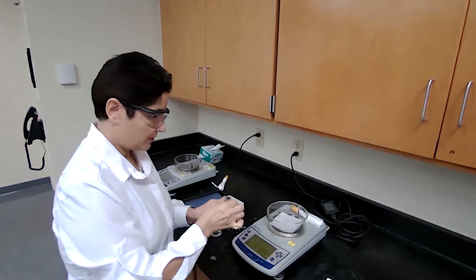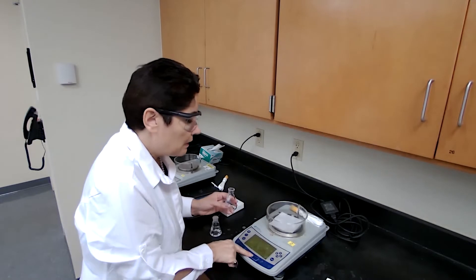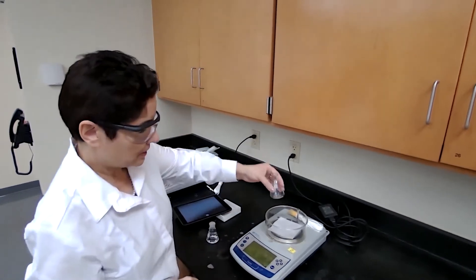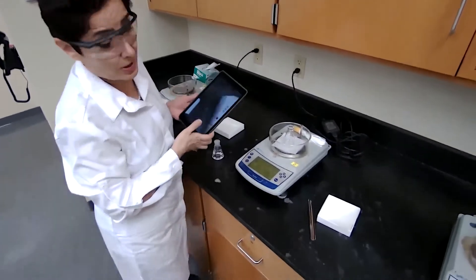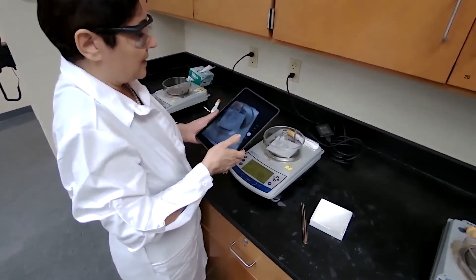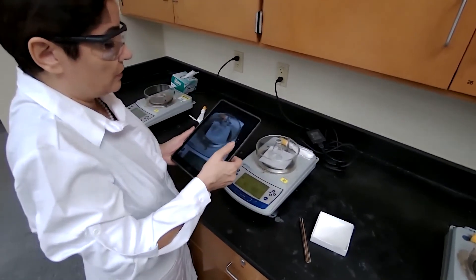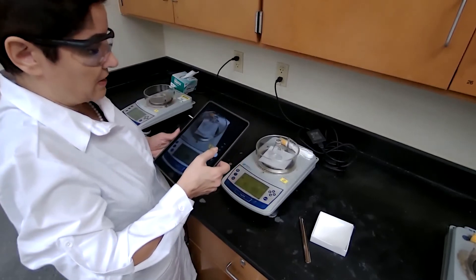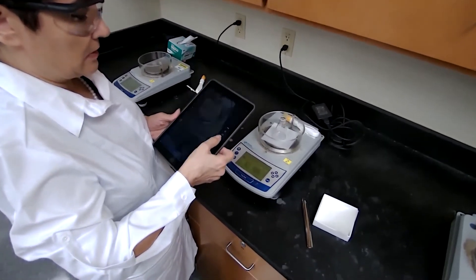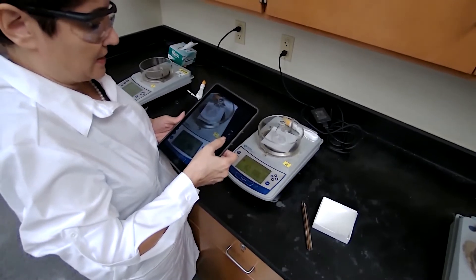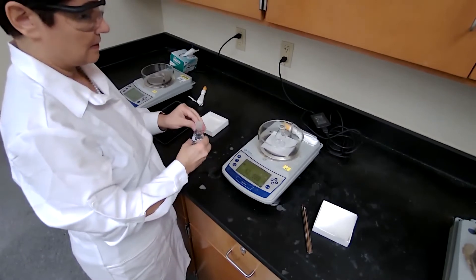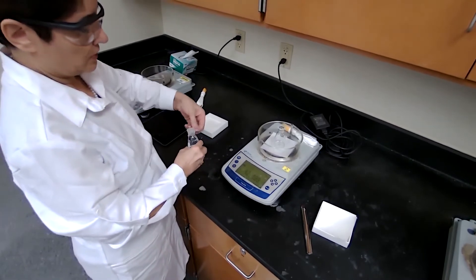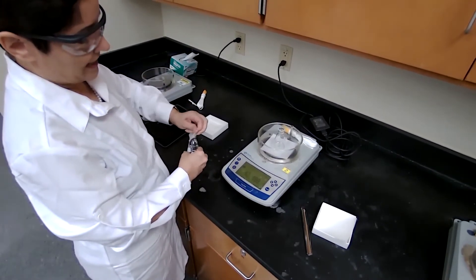We need a pre-weighed container. Tare off the balance or scale, place the clean dry flask. If more than one group is working here, you must label your container. So I have the mass of the empty flask.